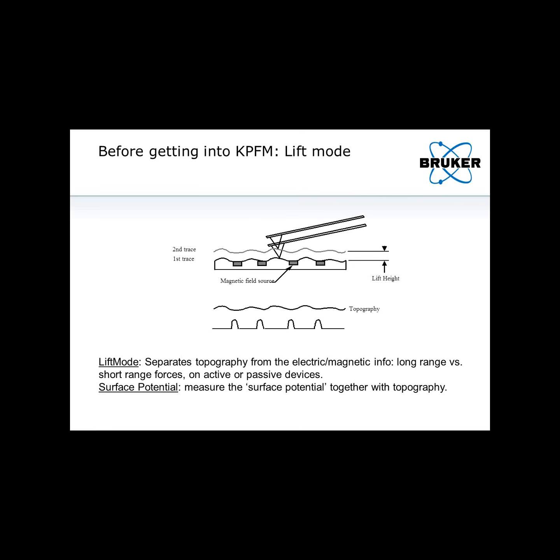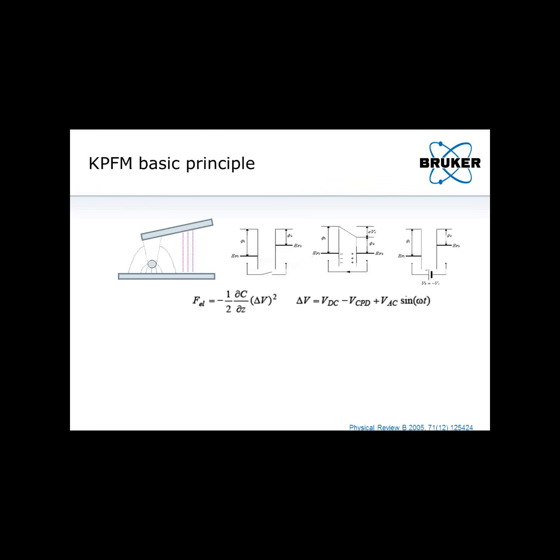So the purpose of this is to separate topography from the electric or magnetic information if you're doing MFM. And it helps you with getting rid of artifacts, which is something that I'll touch on later. Okay, so let's talk about KPFM and how it works.